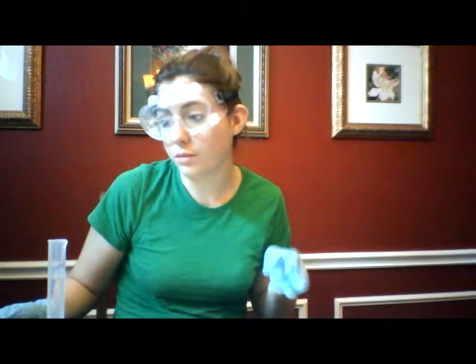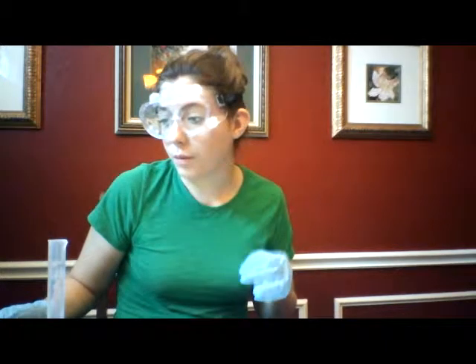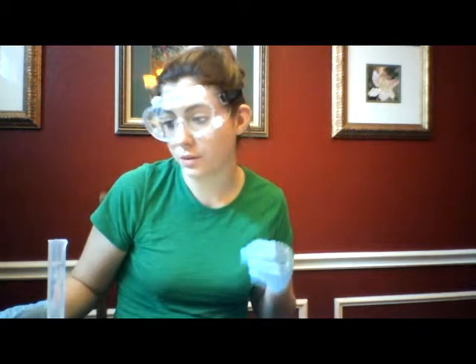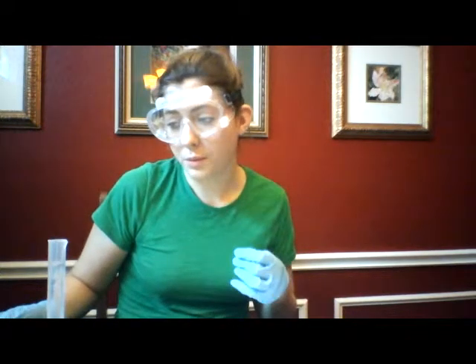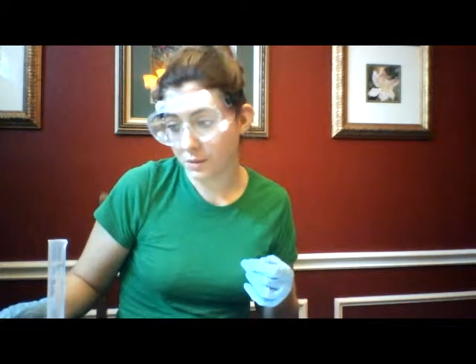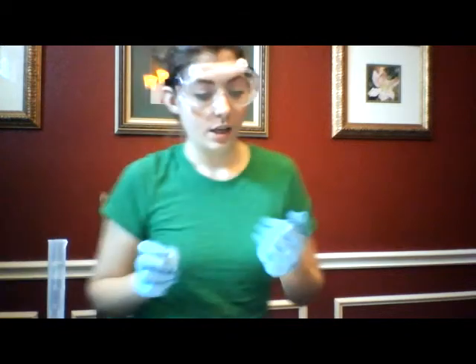At the end of the lab, we're going to be breaking up the reactions into 3 groups. Anions that will not precipitate in the presence of silver nitrate. Group 2 are anions that will precipitate in the presence of silver nitrate, and the resulting precipitates will dissolve upon acidification with nitric acid. The third group will be anions that will precipitate in the presence of silver nitrate, and the resulting precipitates will not dissolve upon acidification with nitric acid. So once we get all our results, we will be able to put them into those groups.